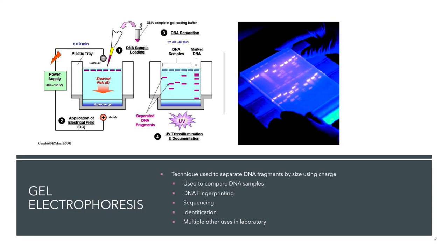Now in the last lecture we talked about restriction enzymes, and if I expose a plasmid to a restriction enzyme where this plasmid might have two different places that the enzyme cuts, or let's say 3 places just to make it interesting, that's going to result in 3 fragments. And these 3 fragments might be of varying lengths. They're going to be of different lengths or size, and length is determined by the number of base pairs. So I want to be able to separate them.